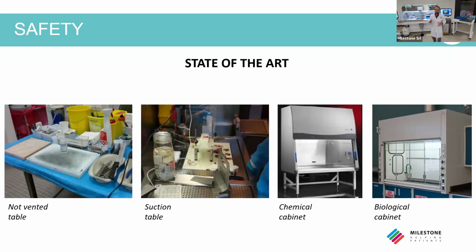Now I want to show you a brief state of the art, how laboratories work all around the world. The first image is not a suction table, it's just a simple table with a grossing cutting board over the top. No ventilation, so operators are fully exposed to toxic fumes.